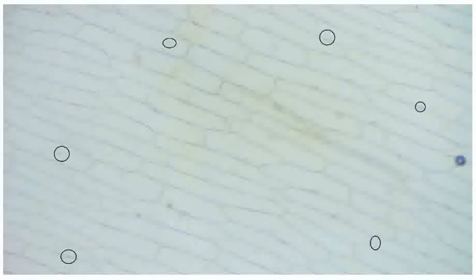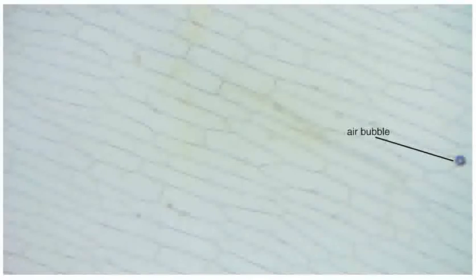What could these small black circles be? These are starch granules, which have been stained black by the iodine. This is just an air bubble trapped under the cover slip.